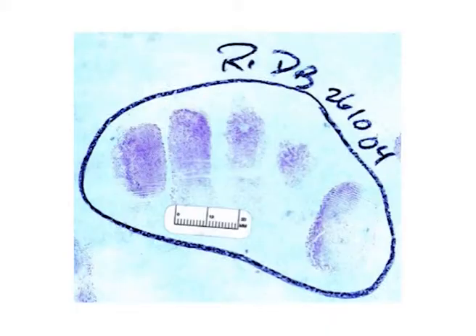This reaction may be used to overcome the contrast problem of ninhydrin developed prints as well as to improve the stability of finger marks. The reaction of Ruhemann's purple with a group 12 metal salt like halides or nitrates of zinc, cadmium or mercury in an ethanol Freon 113 solvent mixture produces a photoluminescent complex. However, invariably zinc chloride is the reagent of choice for post-treatment operations.